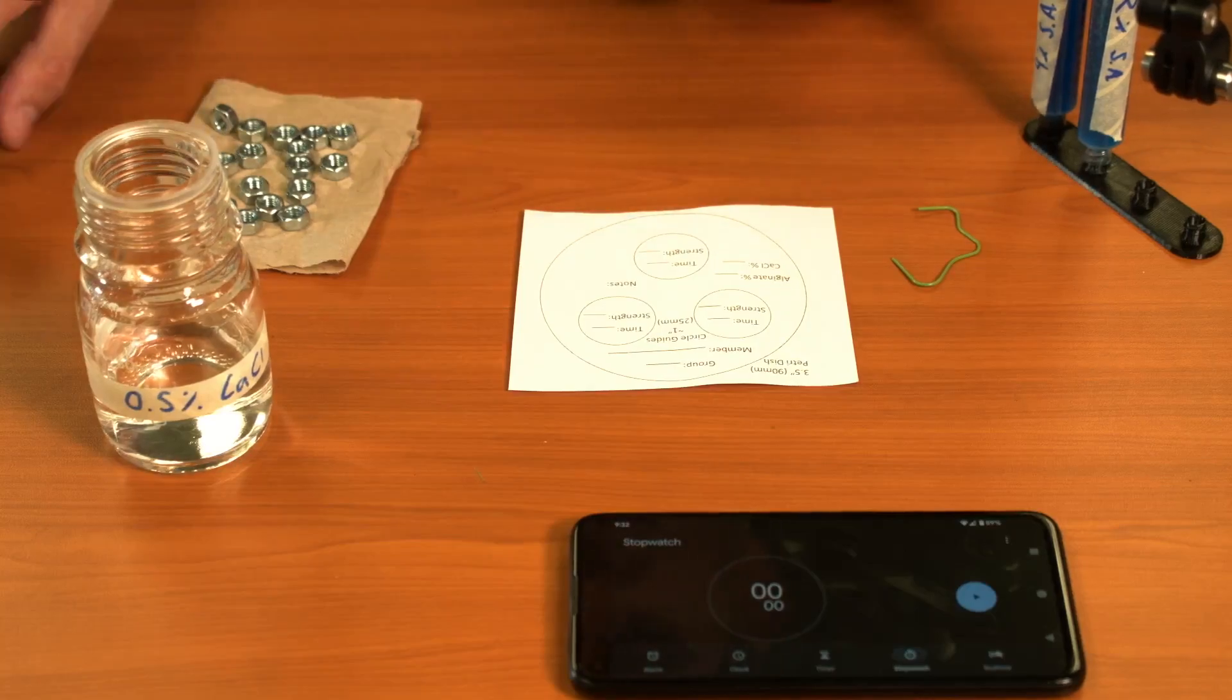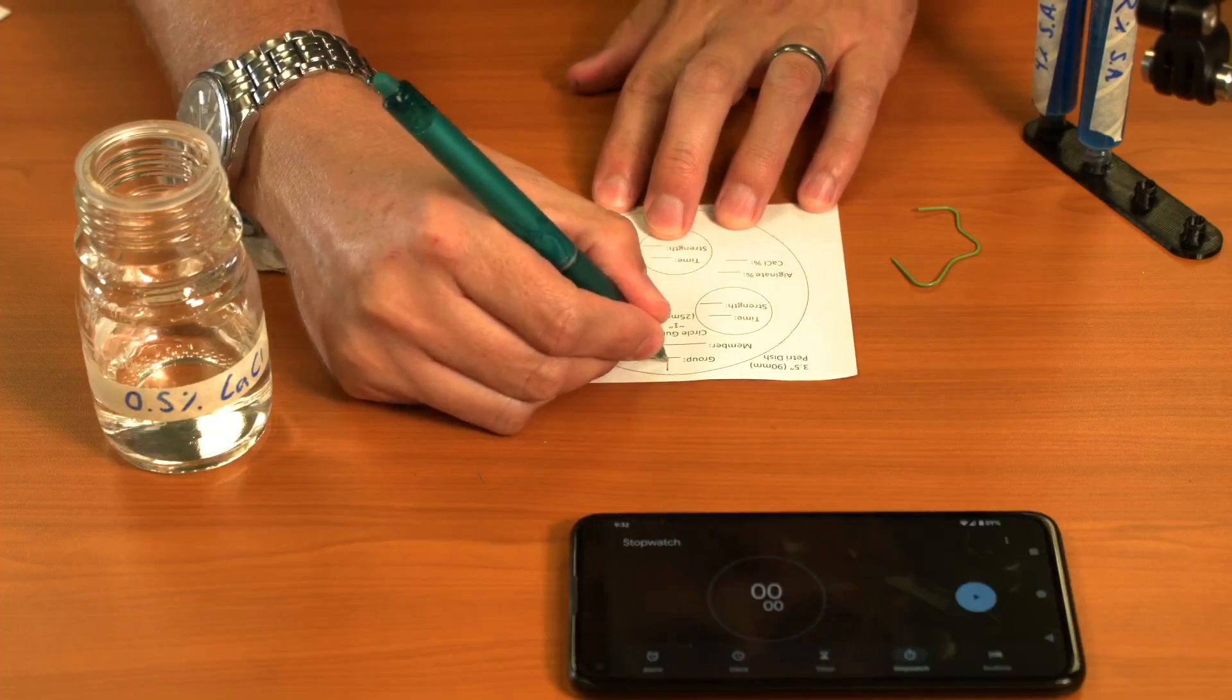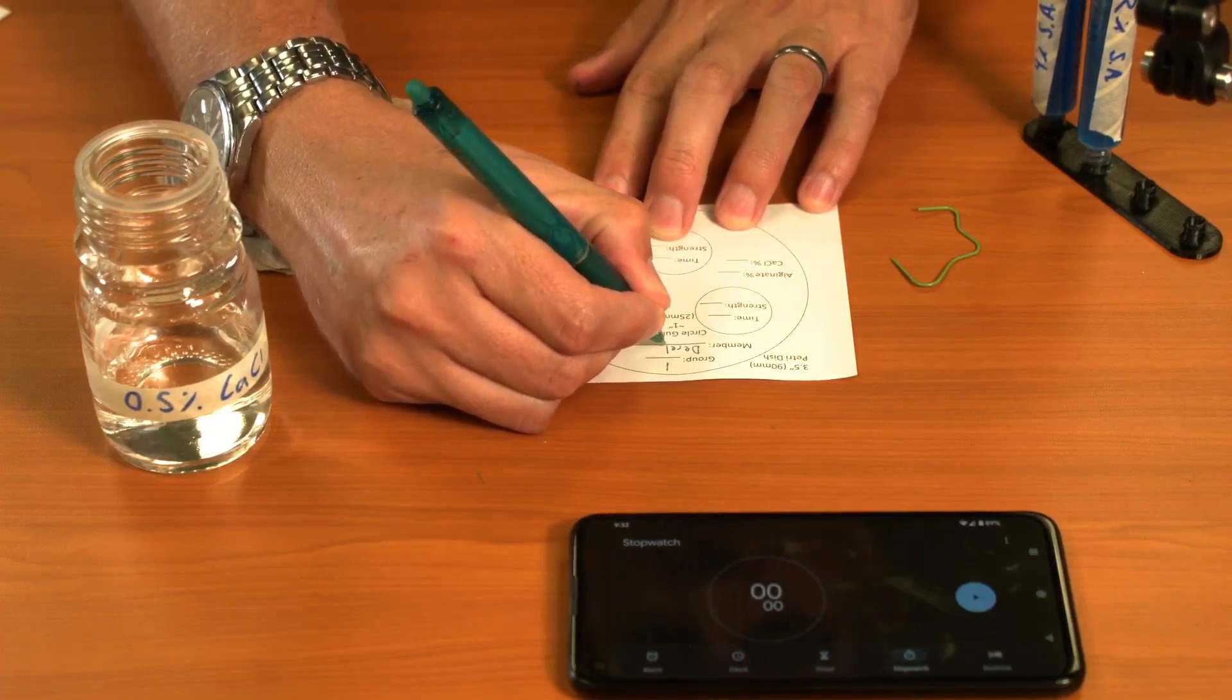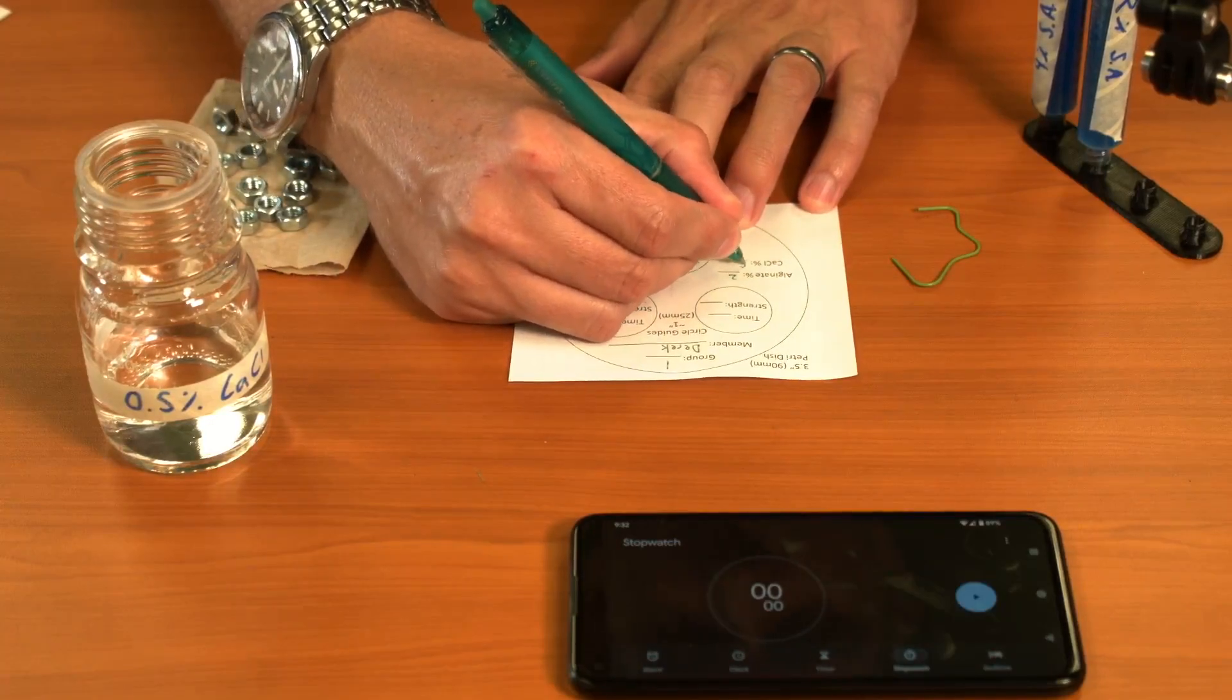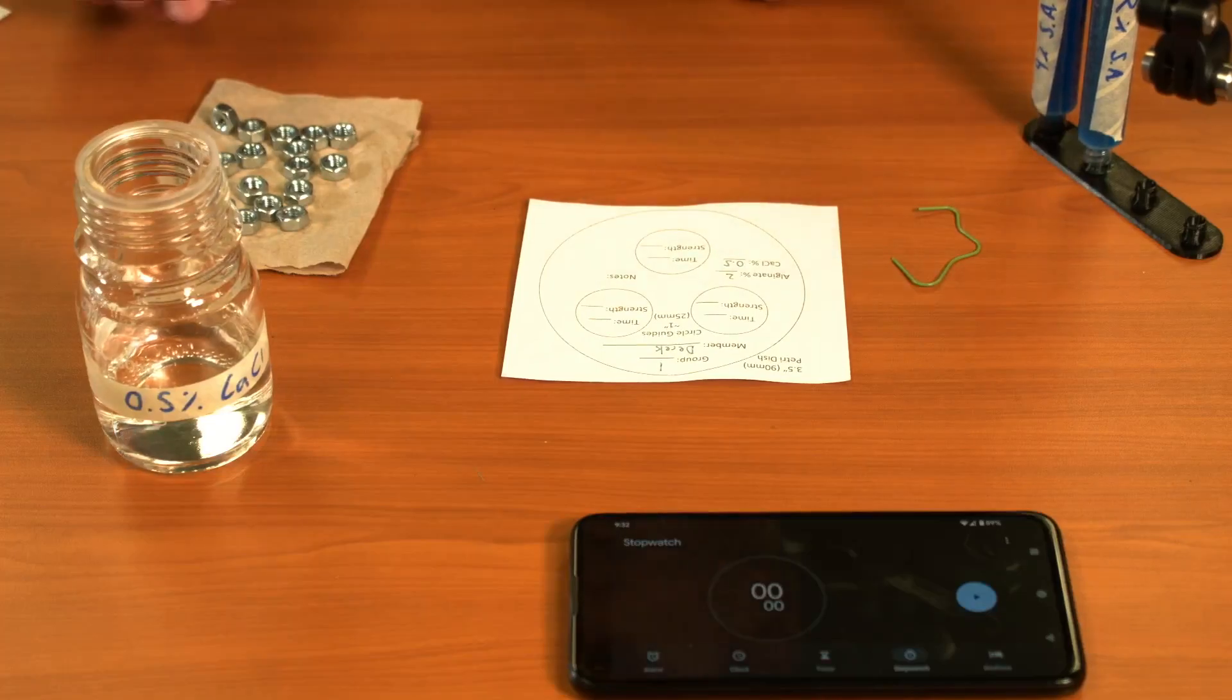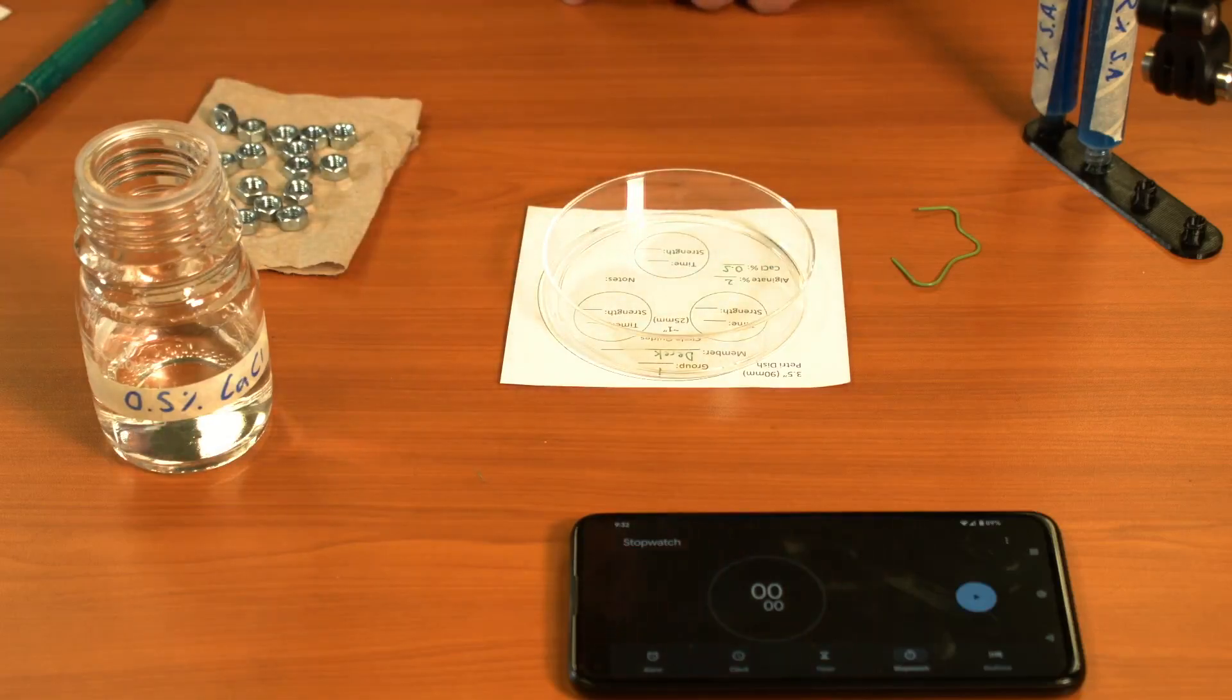The first thing I'm going to do is note that I'll make myself group one. I'm going to do a 2% alginate and a 0.5% calcium chloride. Once we've got that noted down, I'm going to take my petri dish and put it right on top of my guide.